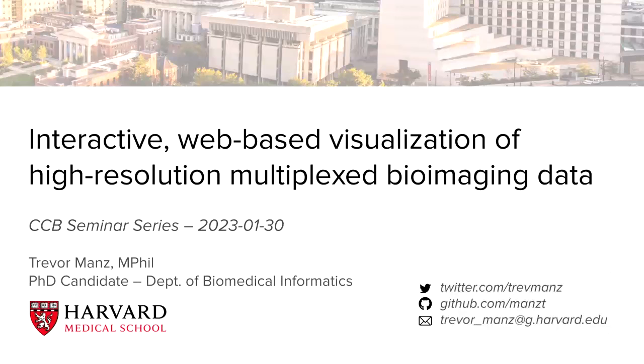And today I was invited to share a project from early in my PhD about web-based visualization of biomedical imaging data. And in particular, I want to talk about how a convergence on cloud-based formats, at the same time as developing this web-based visualization, led to alleviating some common bottlenecks in bioimaging analysis.